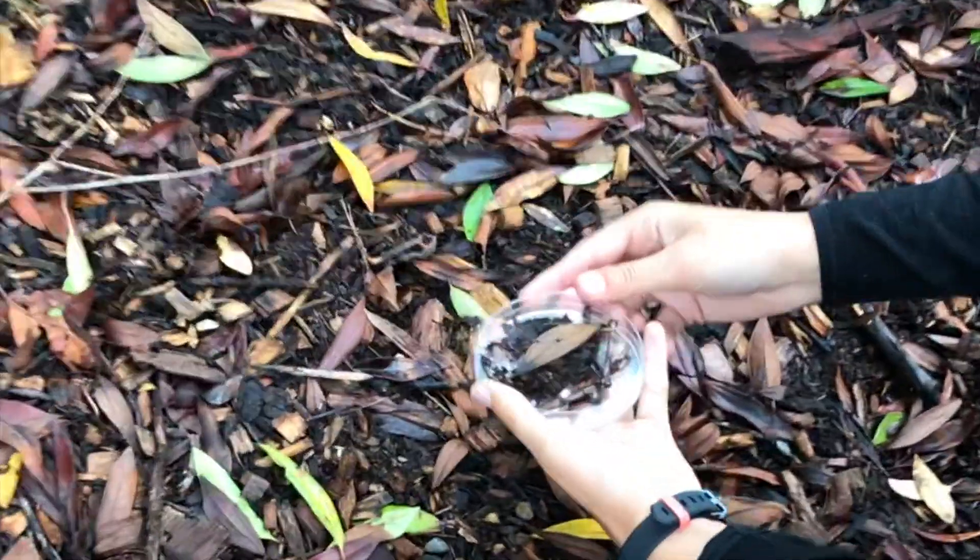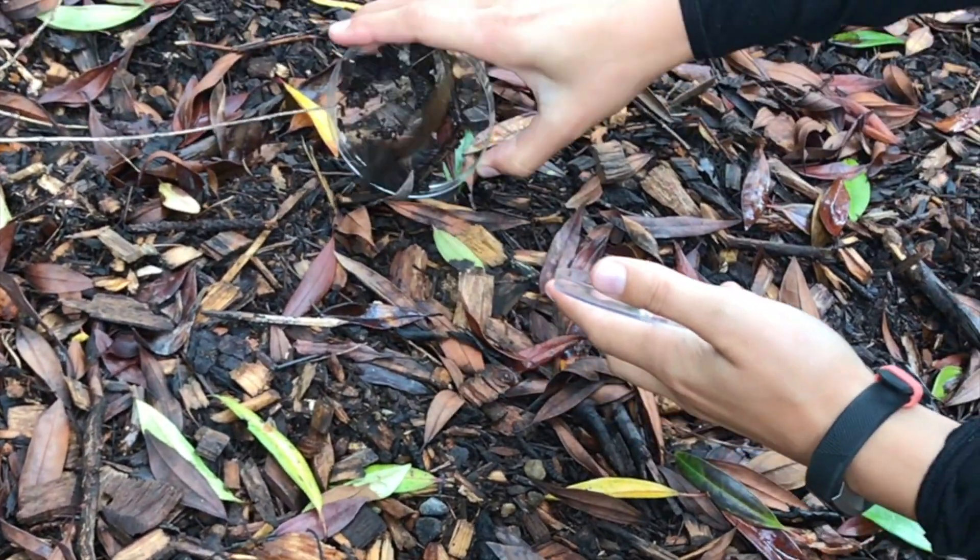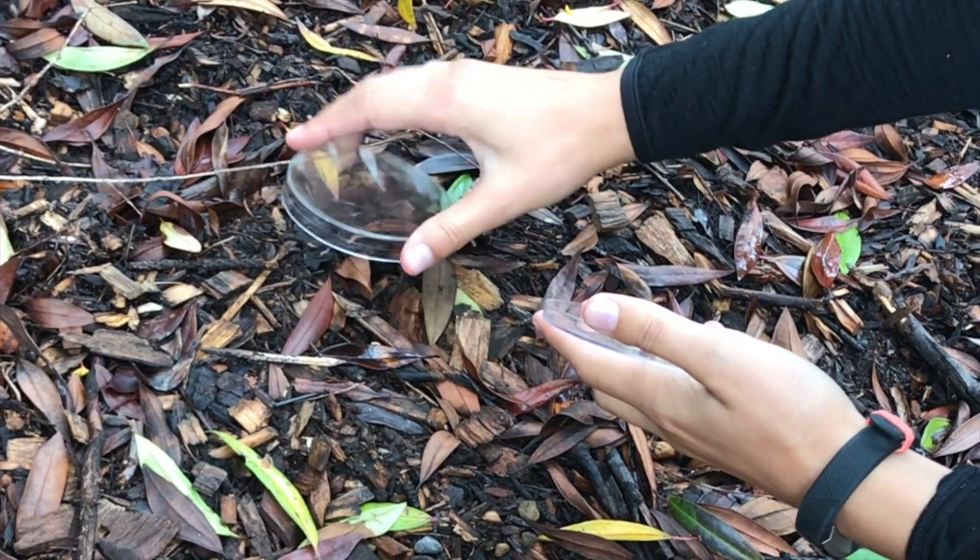When you're done looking through the microscope, gently put the plant material and animals back where you found them. Good luck and we hope you find some fascinating creatures.